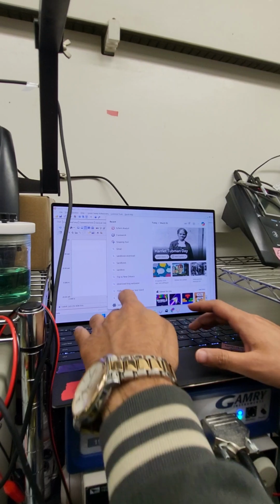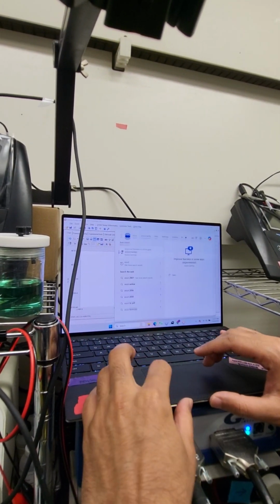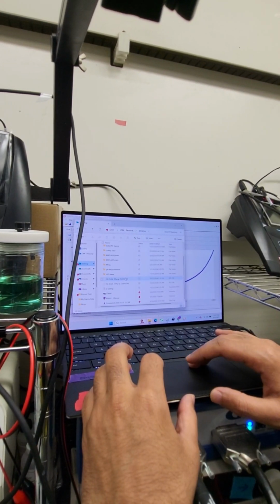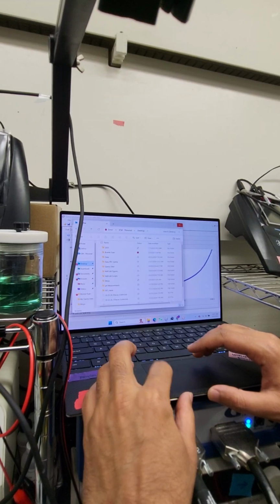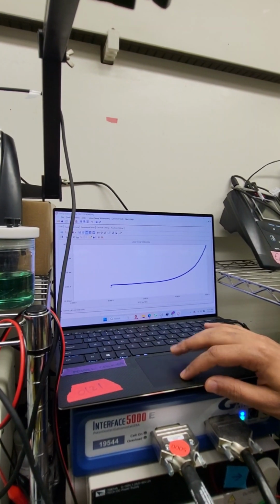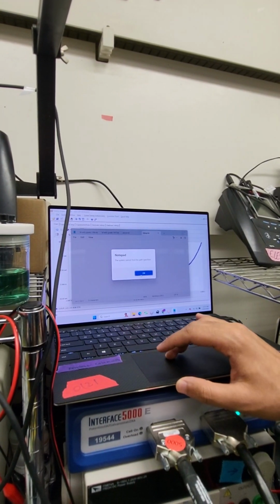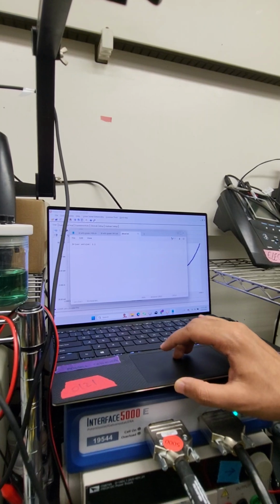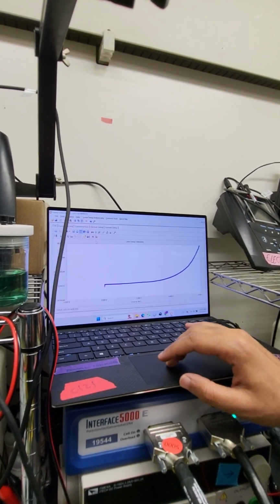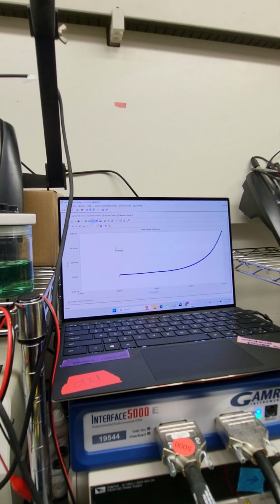But I just want you to also learn that. I think we have an Excel file. It might not be on this laptop, but even if not, you can copy and paste into Notepad or WordPad, or anywhere, and send me these two files, or directly these files which I can analyze. So we'll stop it.